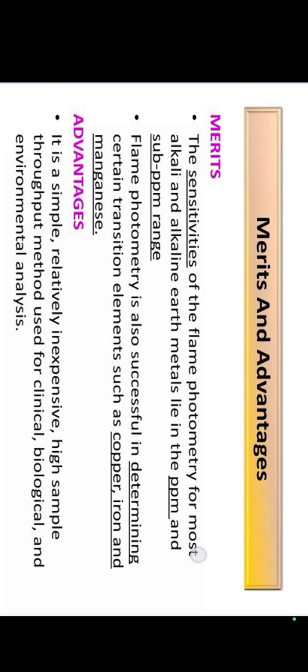Merits: the main merit is sensitivity, and it can determine elements such as copper, iron, and manganese. Next, another merit is that the turbulence is small, so it is noiseless. Some flame photometers are noiseless, but some are not.